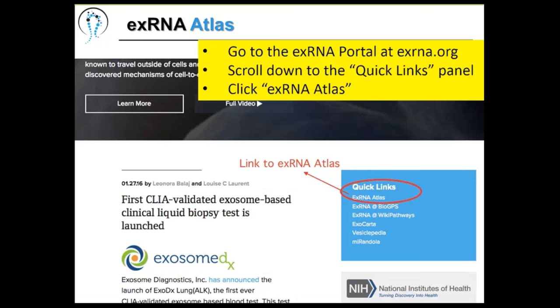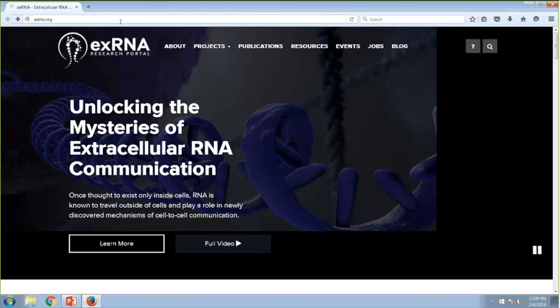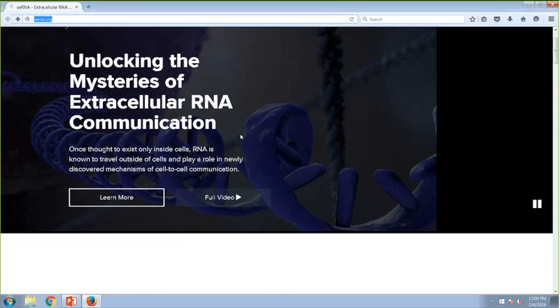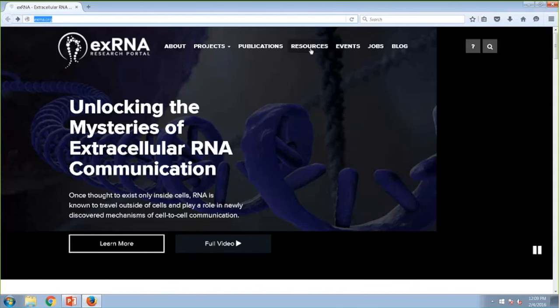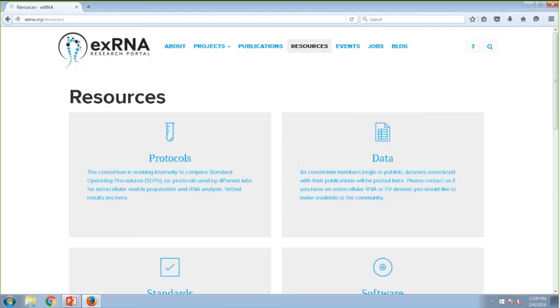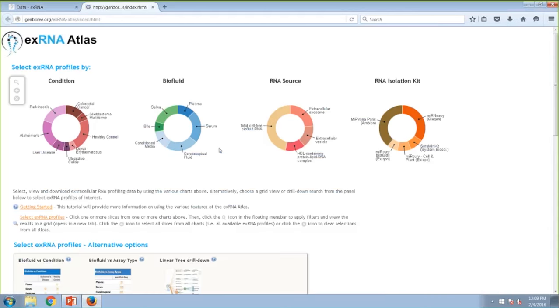Let's see how we can get to the Atlas. You can first go to the XRNA portal at XRNA.org. If you scroll down, you'll see a quick links panel, and the very first link there is the link to the XRNA Atlas. Alternatively, if you go to the top menu bar, you'll see a resources section — click there, then go to the data section, and you'll find the XRNA Atlas link there as well. Both ways take you to the same place.